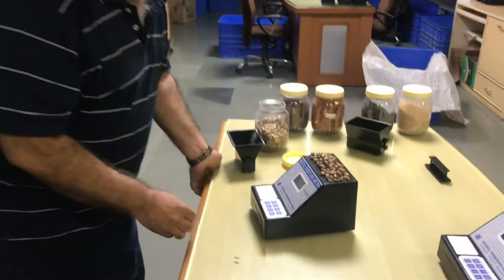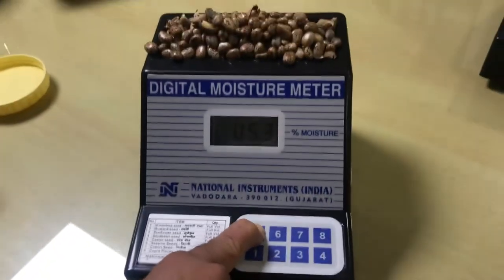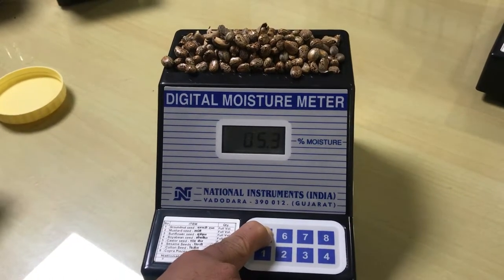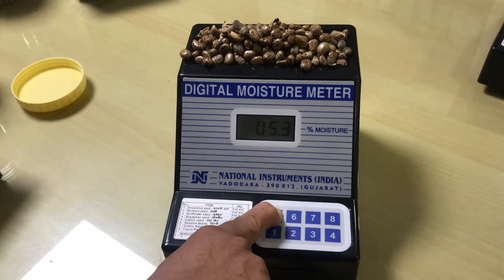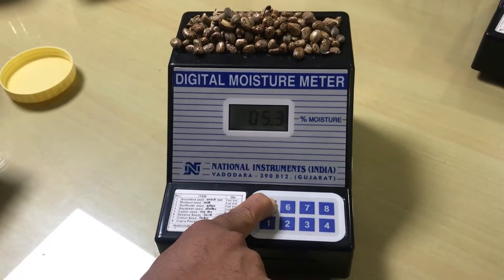Now, the number 5 key is calibrated for Castor seed. If you press the number 5 key, it will indicate the moisture content in the Castor seed. Right now, it indicates 5.3% moisture in the Castor seed.